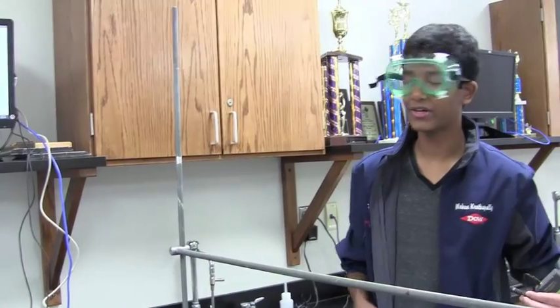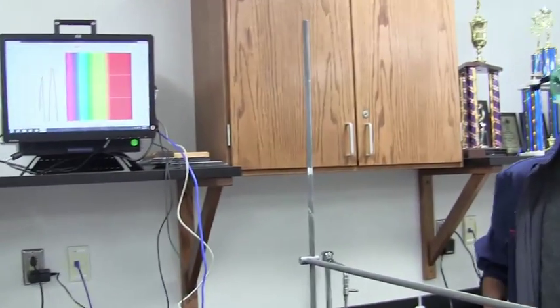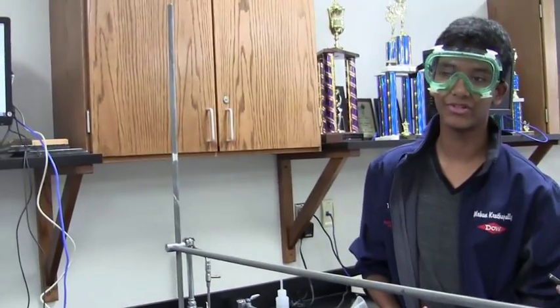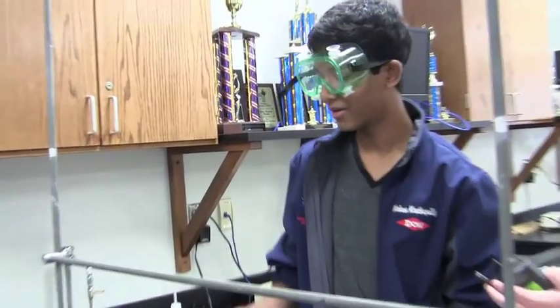Since we got the data on scale, we can find out that it only absorbs UV light but not visible light, and that shows us that there are double bonds in the structure of our sample.